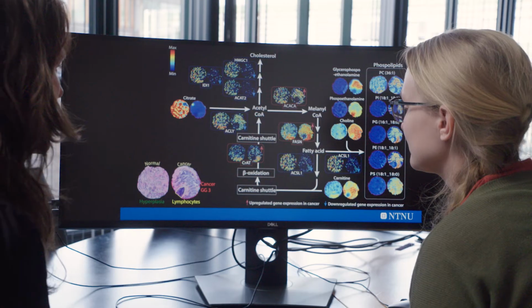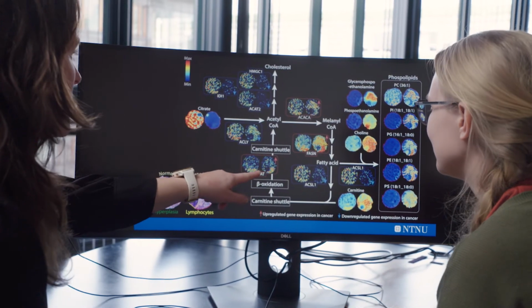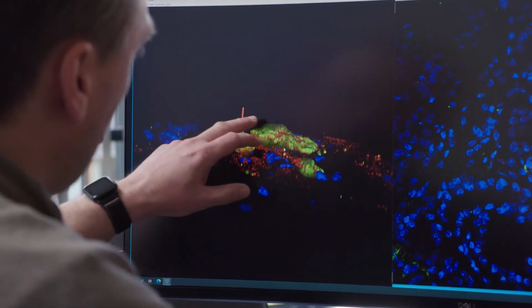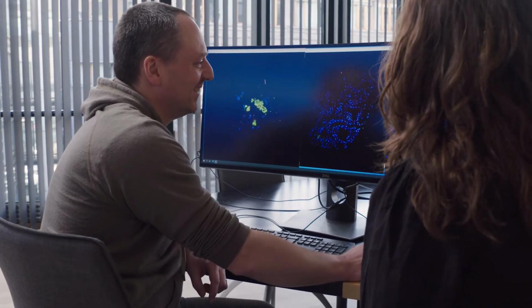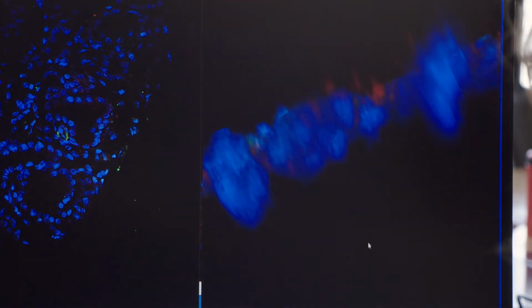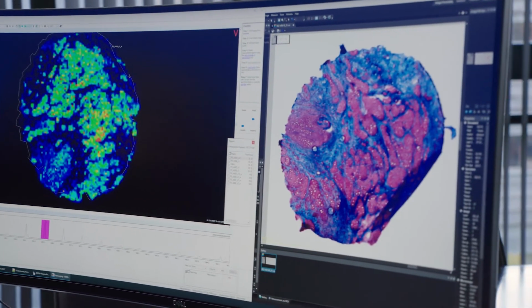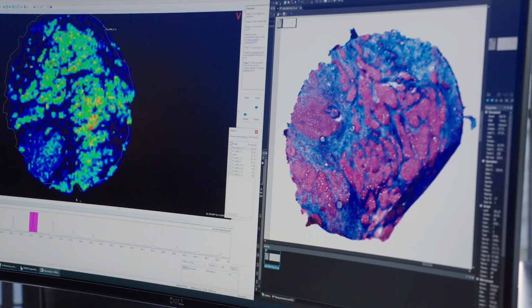We also use spatial transcriptomics, where we can see gene expression of thousands of genes like a map on our tissue samples. We also use different microscopy techniques like confocal microscopy, where we stain different compartments or specific proteins of each cell in the prostate tissue to get really detailed 3D images of the selected proteins. So by integrating the data from the multi-omics results, we aim to understand more about the molecular mechanisms that separate aggressive from slow-growing types of prostate cancer.